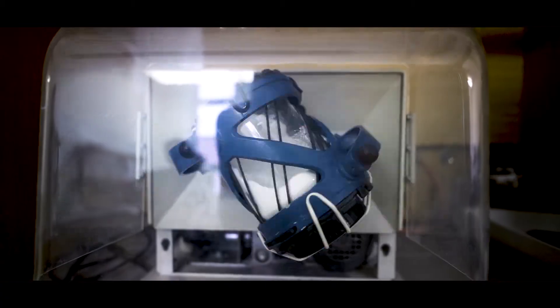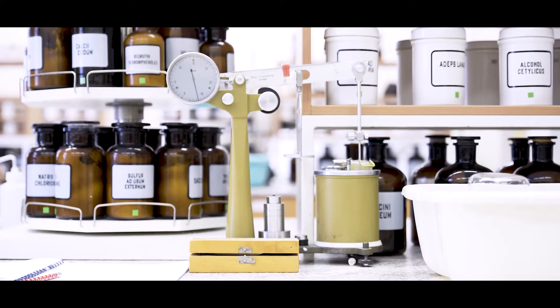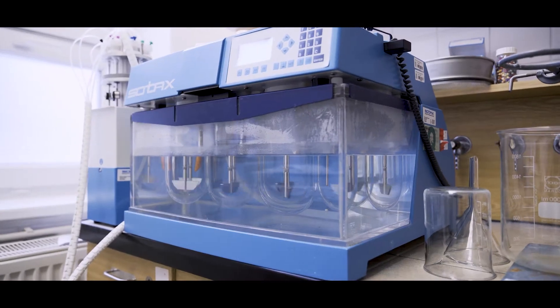To estimate the correct dose of loose white powder can be quite difficult. This is a challenge we are up for in the pharmaceutical technology labs.